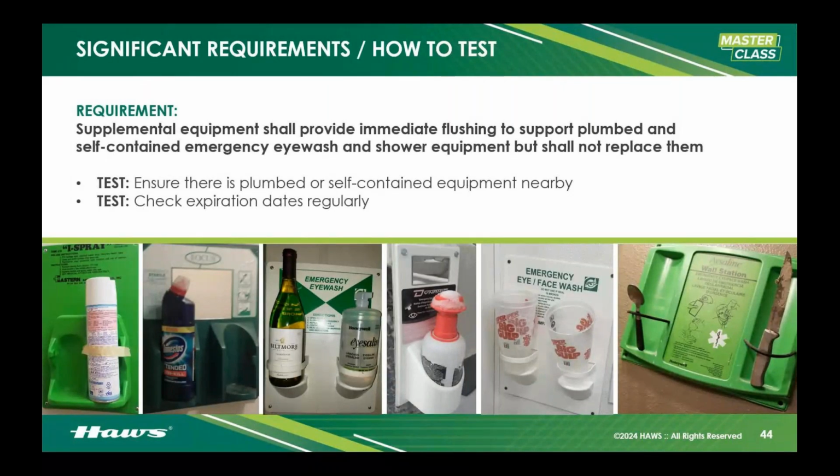Supplemental equipment is excellent when it is well maintained and taken care of. I see one in place here that's not frozen or missing, and that's that Honeywell unit there, kind of in the middle. As long as you are checking the expiration date and ensuring the unit is there and full on a weekly basis. These also require a weekly test, and that is just visual: ensure that they're there, they're full, they haven't been used, etc.